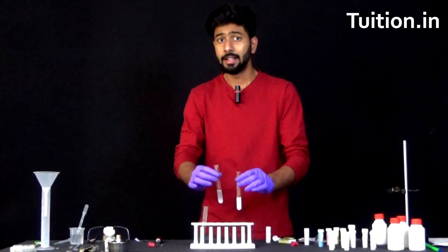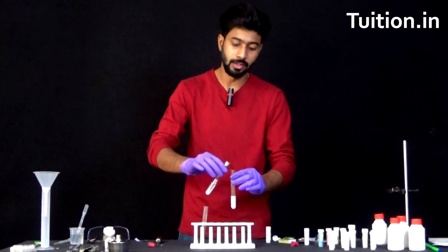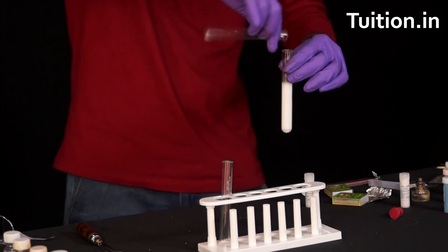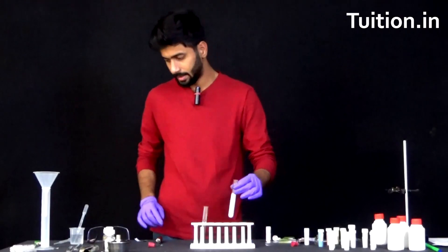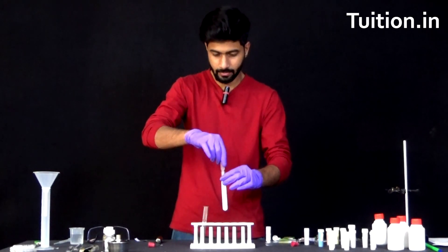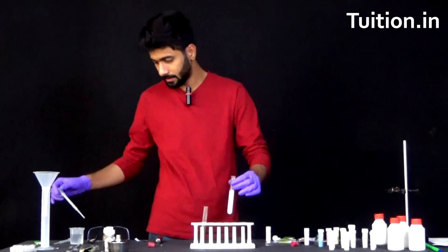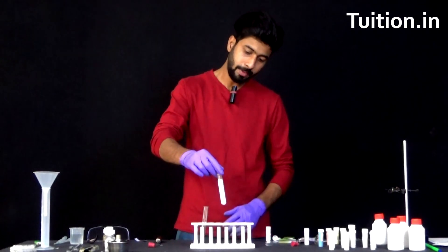Next, what we are going to do is put the sodium sulphate solution into the barium chloride solution. So it's turned completely white now. It's time for us to shake it for some time. Let's use a dropper to mix it. So this is properly mixed.